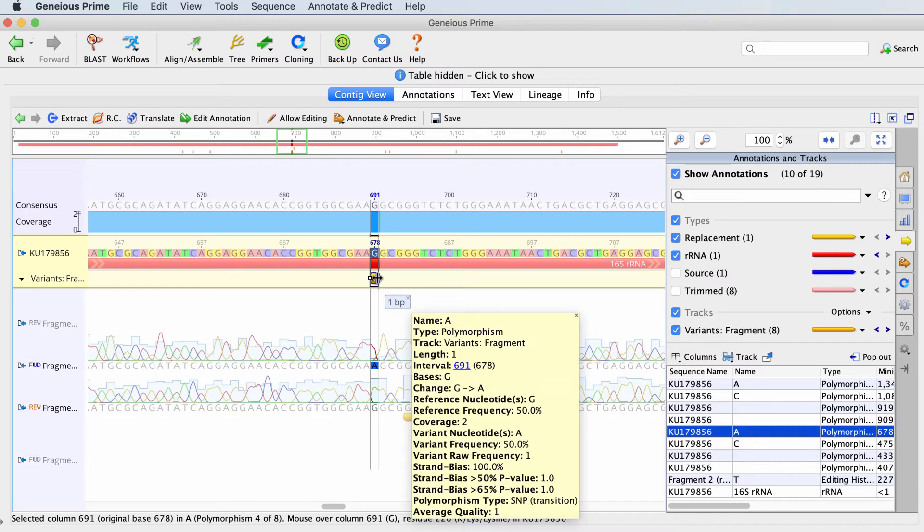If you have CDS annotations, Genius can also tell you about how that snip affects the protein, whether it will cause a substitution, create a stop codon, or maybe cause an extension.